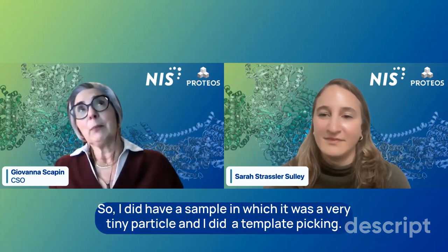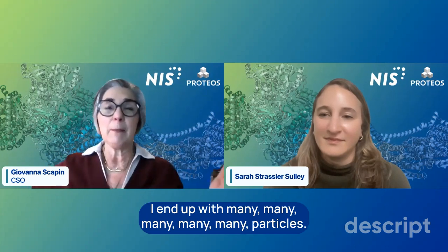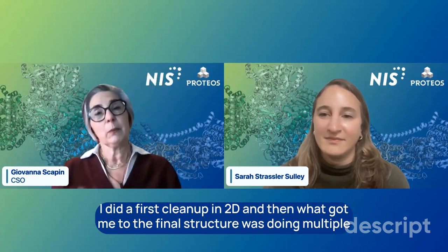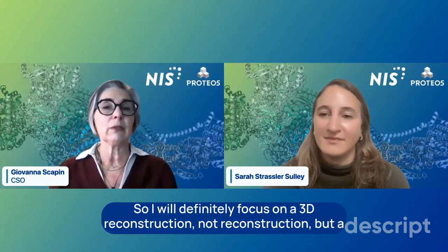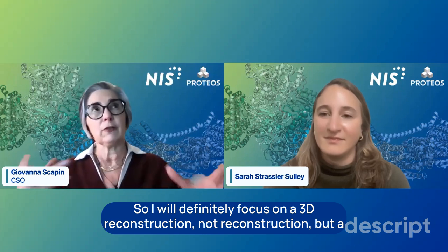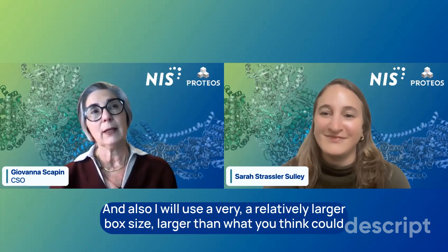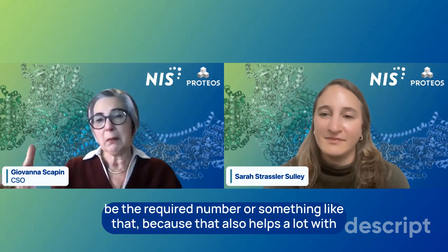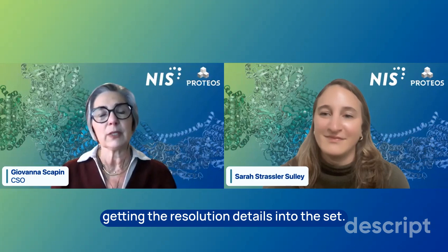So I did have a sample in which it was a very tiny particle, and I did template picking. I ended up with many, many particles. I did a first cleanup in 2D, and then what got me to the final structure was doing multiple rounds of 3D to clean up the particle set, pick the right one, and everything else. So I would definitely focus on 3D, not reconstruction, but classification, more than 2D classification when the sample is very small. And also I would use a relatively large box size, larger than what you think could be the required number, because that also helps a lot with getting the resolution details.